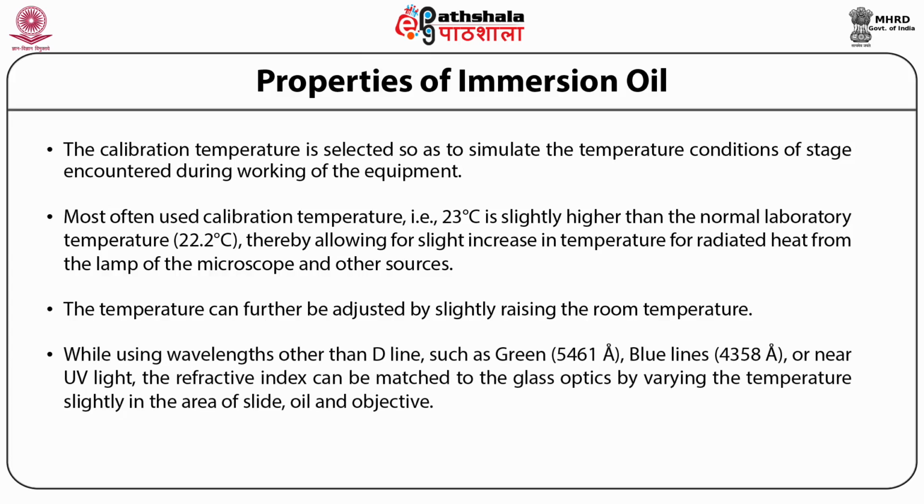While using wavelengths other than the D-line, such as green, which is 5461 angstroms, blue lines, which is 4358 angstroms, or near UV light, the refractive index can be matched to the glass optics by varying the temperature slightly in the area of the slide, oil, and the objective.